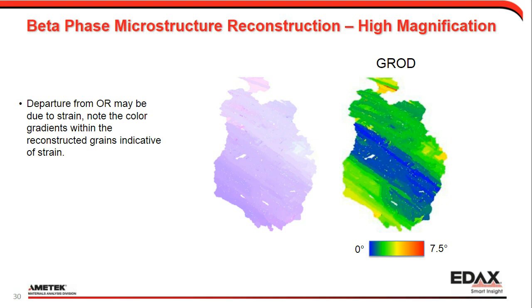And that's kind of interesting because that tells us that the reconstructed grain seems to have a fair amount of deformation to cause that change in orientation that we've talked about before. And so that just shows an example of, even though we have a departure in orientation with that much spread, we're able to still reconstruct the grain, which is good news.